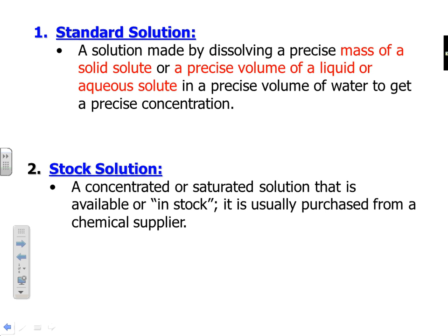But we are doing more precise work, so we use a more precise scale. Scales like these, oh, they're probably in the $10,000 range, all right? So obviously that's prohibitive for us to have just as a high school, but universities where you're doing very precise work can afford that type of thing, all right? So we're going to use the 2 decimal scale, as precise as possible.